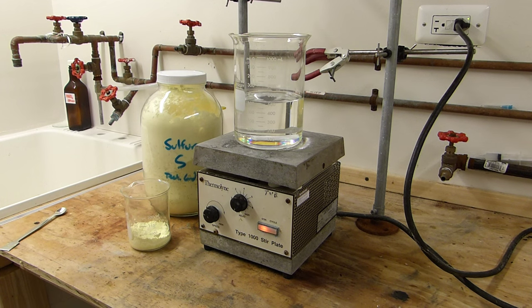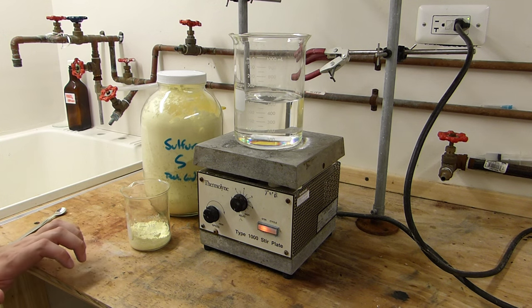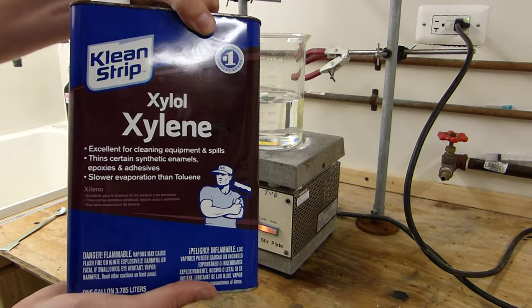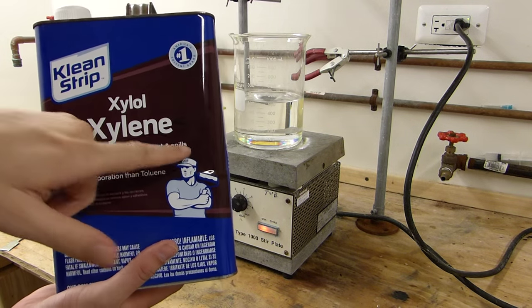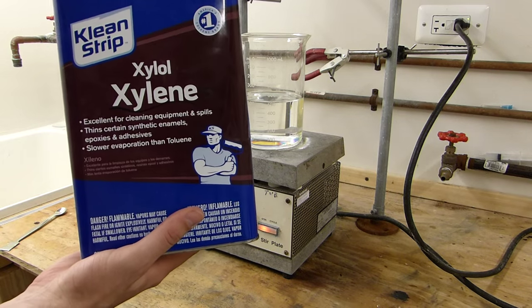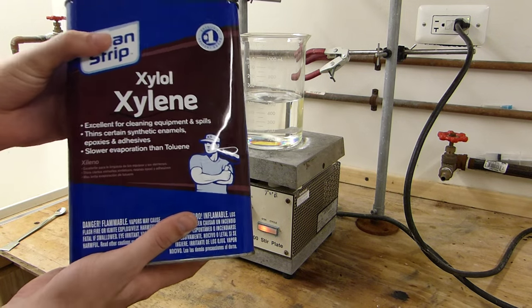But at the hardware store you can get one solvent that works pretty well for sulfur, and that is xylenes. Notice I didn't say xylene, it's xylenes because this is actually three isomers of xylene, xylene being dimethylbenzene.